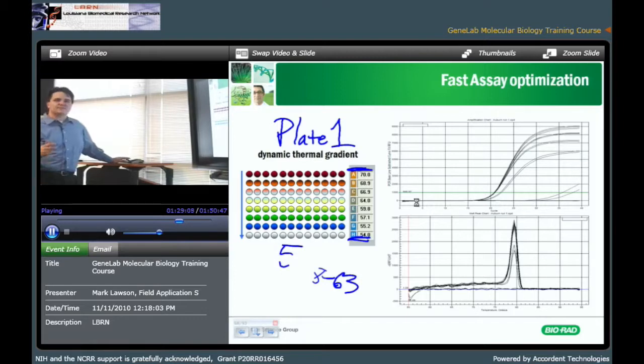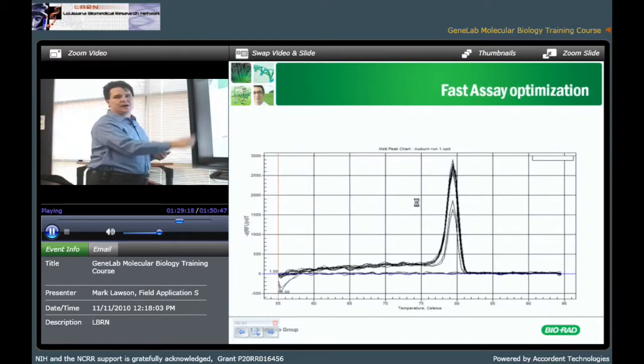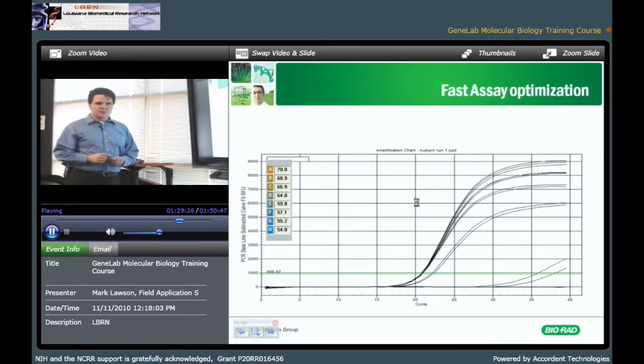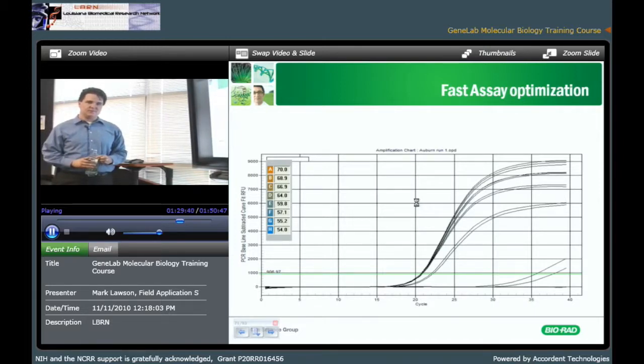We're going to check two things for the same reaction, for the same replicate, run at different temperatures. We're going to look for no non-specific products. That means a single high-temp melt peak. And the other thing we're going to look for is the earliest CT value. So no non-specific products means that we don't have any primer dimer, and we don't have any pseudogenes amplifying. The earliest CT value tells us that we're at the most sensitive temperature. So for all of the specific temperatures, which one gives us the earliest CT value for the same sample? That's the most sensitive specific assay.